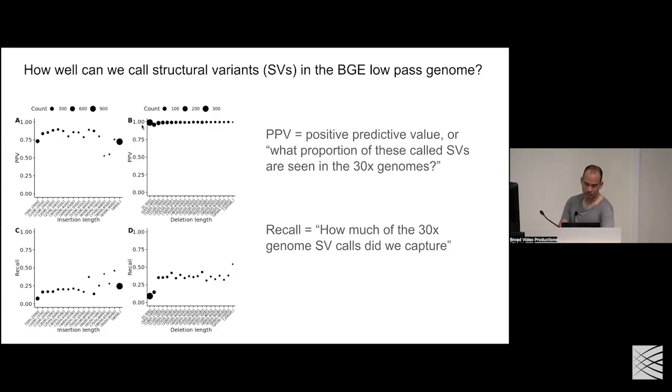But as it currently stands with the analysis that was run, it's interesting to think that there is room to capture some rare structural variants outside of the coding region, and say with some confidence that even though you're only capturing a fraction of this stuff, it's most likely real. It's not just filled up with a whole bunch of false positive calls because of the low pass. So that's a little bit of an interesting side note in these analyses.